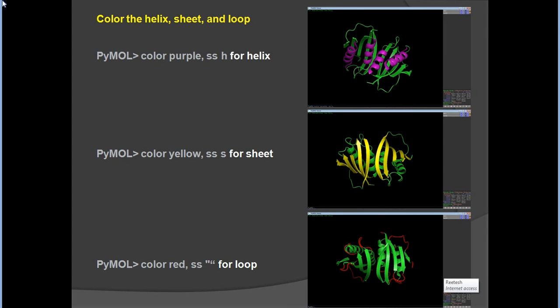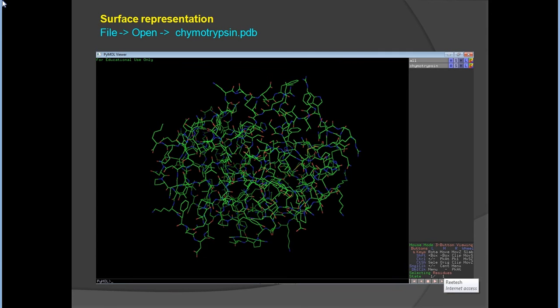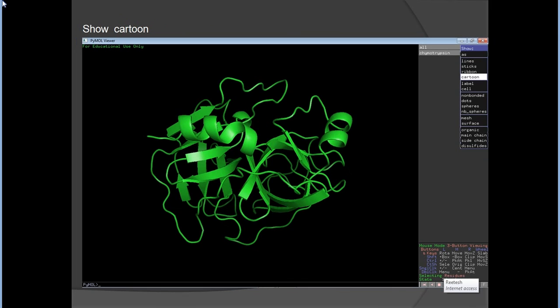To color by secondary structure elements — helix, sheet, and loop — use this text: 'color purple, ss h' for helix, 'color yellow, ss s' for sheet, and the corresponding commands for loops. This allows you to visually distinguish secondary structure elements.